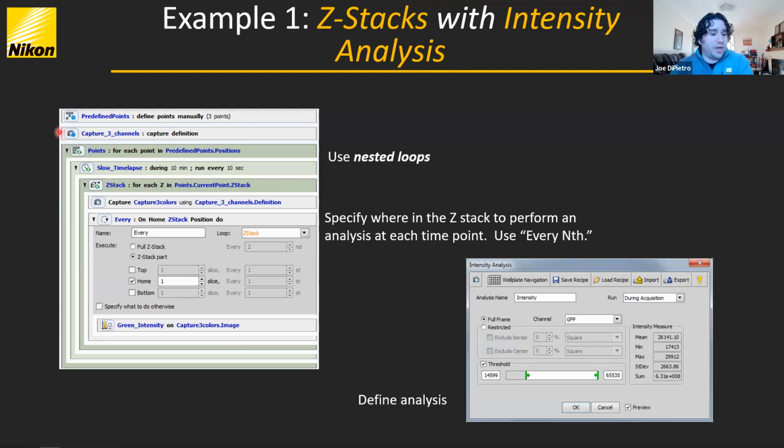So this would be a simple job and you see it's not that many steps, right? Pretty easy to do, and the logic is pretty clear. What points, what kind of images, go to the points, do a time lapse, do a Z-stack, do an analysis.